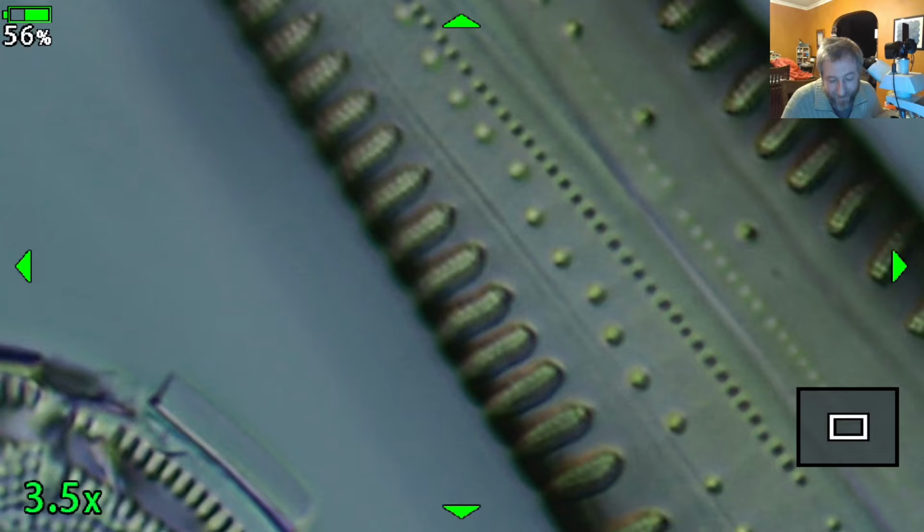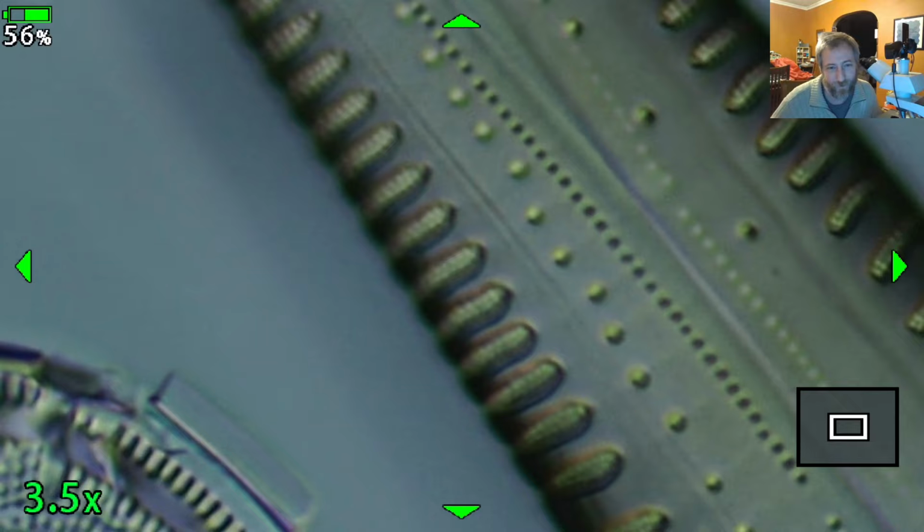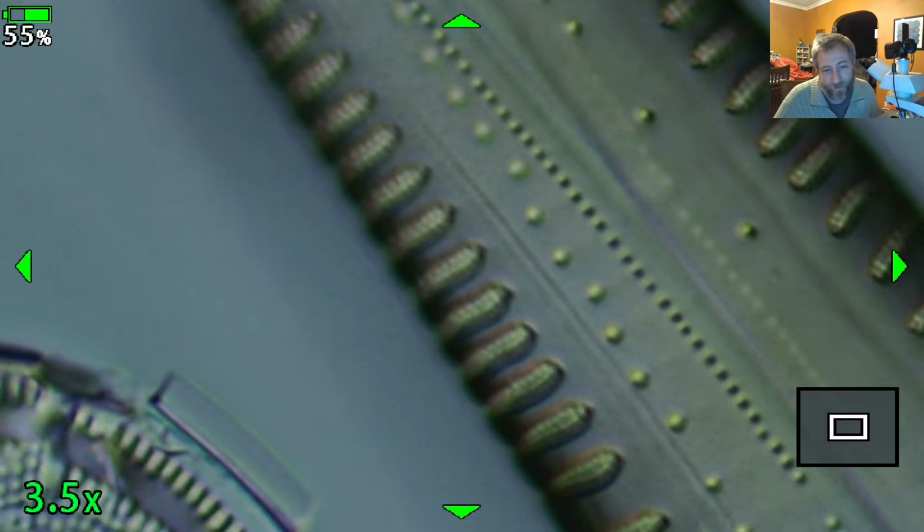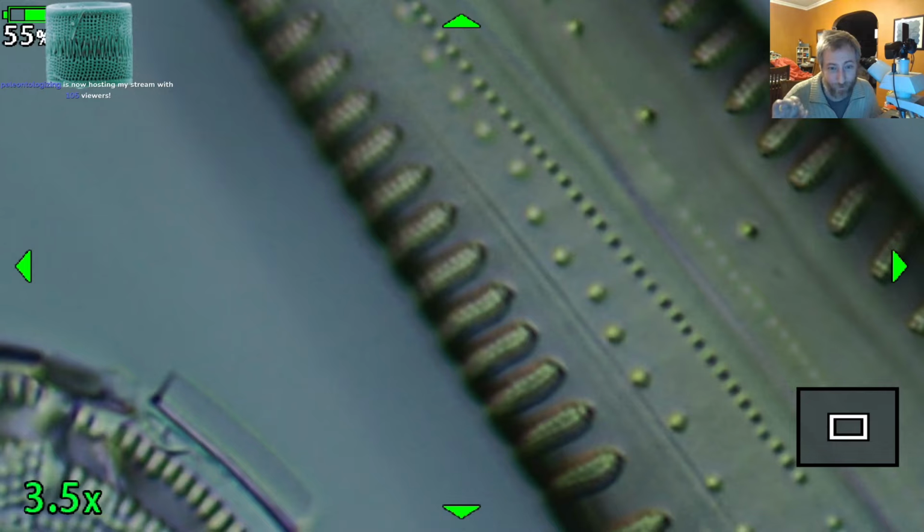So there's two little rows of striae, and in diatoms we refer to that as biseriate. Also in other things, when there's two rows of holes that are side by side that alternate, we refer to that as biseriate. The biseriate rows in this are actually pretty interesting, because Gomphonema, which is where this thing probably belongs, don't normally have biseriate striae. They just have basically either little simple holes or sometimes little C-shaped areoli.